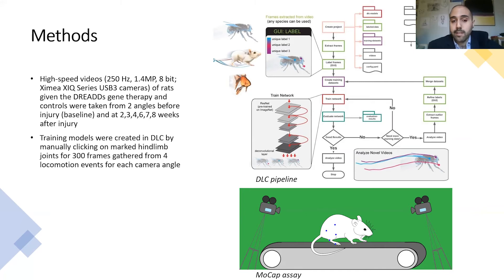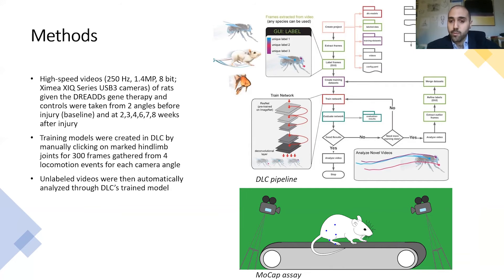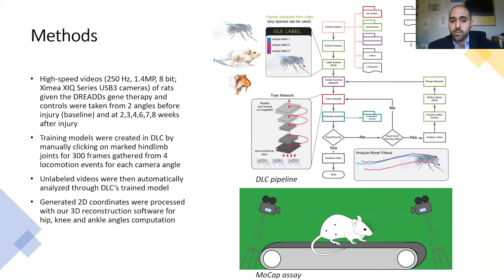Training models were created in DeepLabCut. To do that, we extracted frames manually, then we clicked on hind limb joints that we are interested in for 300 frames gathered from four different locomotion events, for a total of 1,200 frames. We did one training model for each camera angle. Then we grabbed the unlabeled videos, loaded them through the DeepLabCut pipeline, and they were automatically analyzed, generating 2D coordinates.